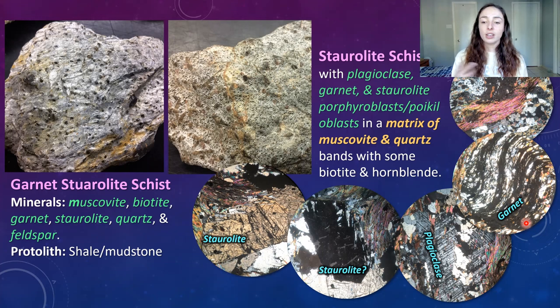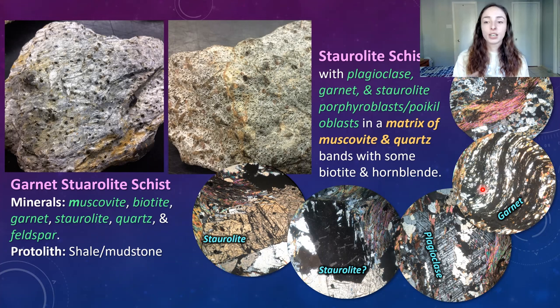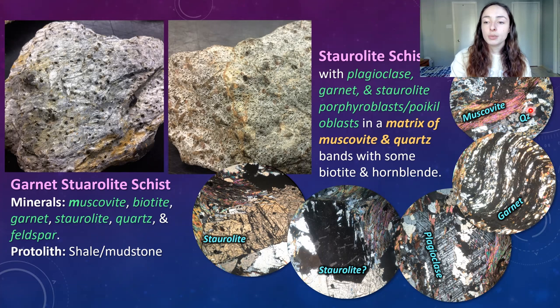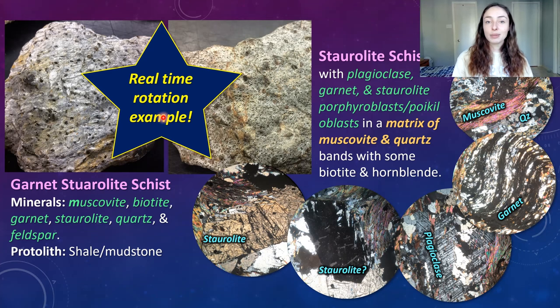Garnet does not have an interference color under cross-polarized light — it remains black or in extinction the entire time you rotate it because it's isotropic. I talk about isotropic versus anisotropic minerals in the optical mineralogy video. Garnet will stay black as we rotate it. The last image has clear muscovite — this bright pink platy mineral band — and then the typical speckly black and white quartz. Now let's look at a real-time rotation example. This is a garnet schist.